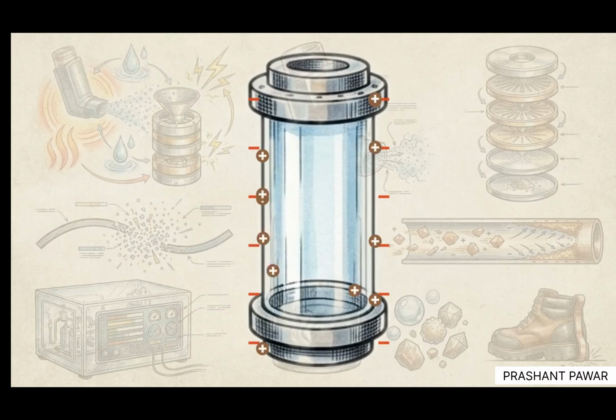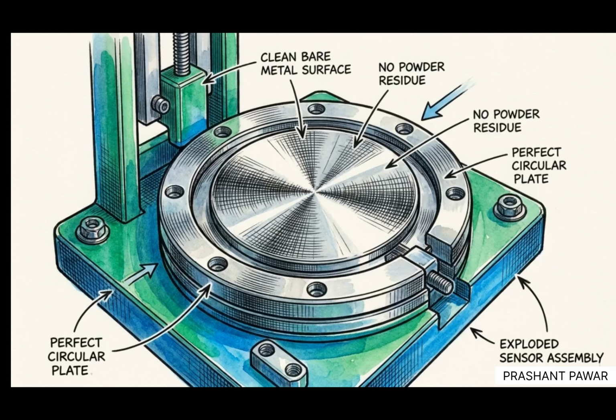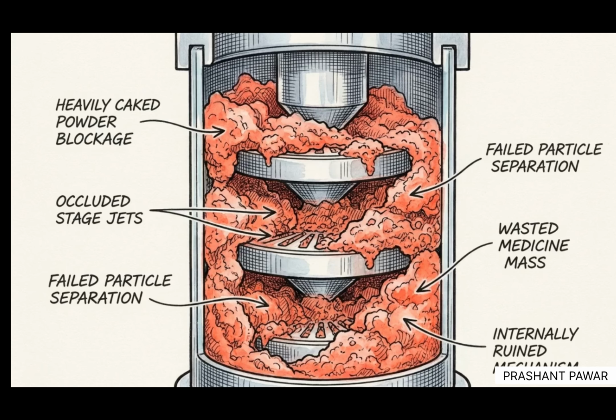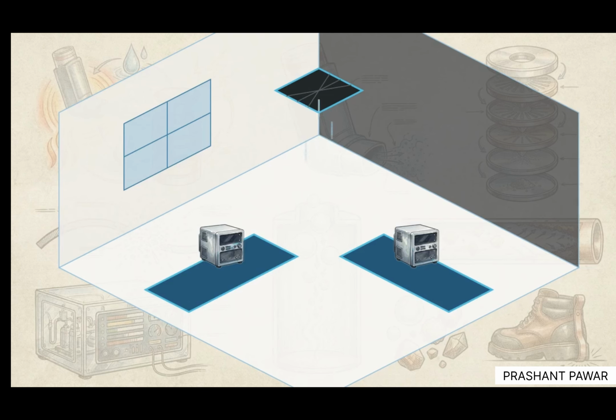The split-second discharge of a medical inhaler into the laboratory testing apparatus creates a high-velocity, violent physical collision. As thousands of drug particles rub together and separate at high speeds, they generate an intense electrostatic charge. This is a phenomenon known as triboelectrification. This generated charge polarizes the particles. Positively charged drug droplets are violently drawn to the negatively charged metallic walls, sticking permanently.